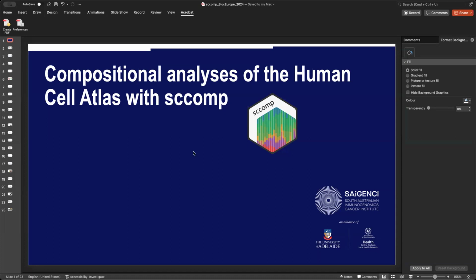Amazing, thanks a lot. Welcome everybody. So today I will show you sccomp, which is a Bayesian method for doing compositional analysis from single cell data, and how we scale our analysis to the Human Cell Atlas with the goal of modeling the immune system in the human body and the population.